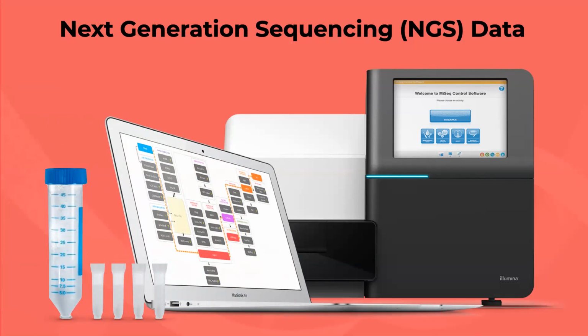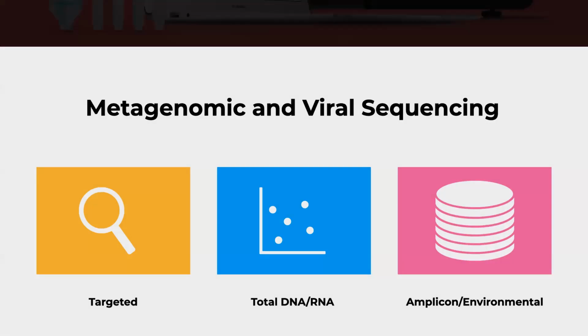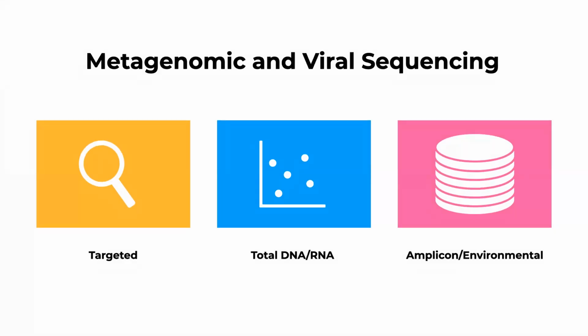trying to sequence. And that's why there are a few different techniques that we'll discuss today that allow us to study viruses and bacteria at different levels. For example, we have targeted sequencing. What is targeted sequencing?